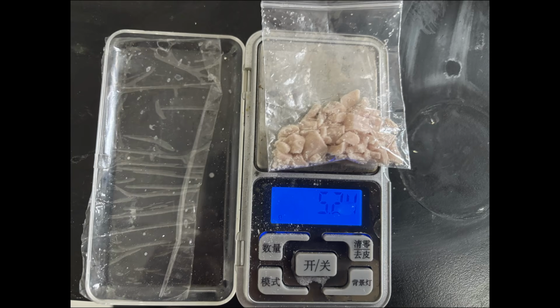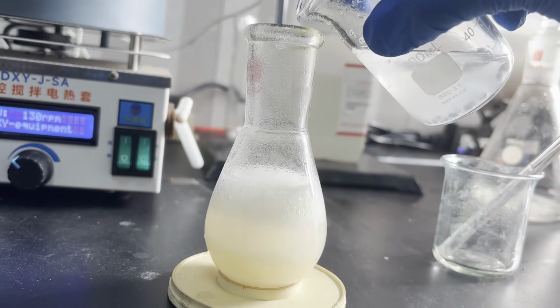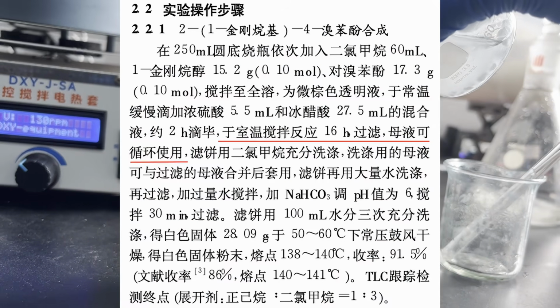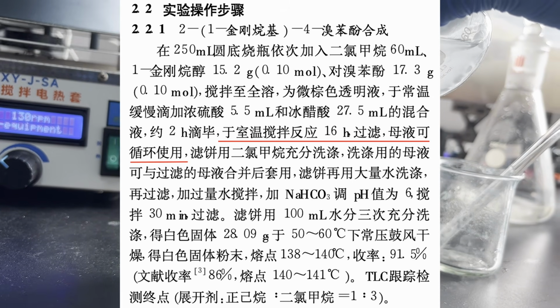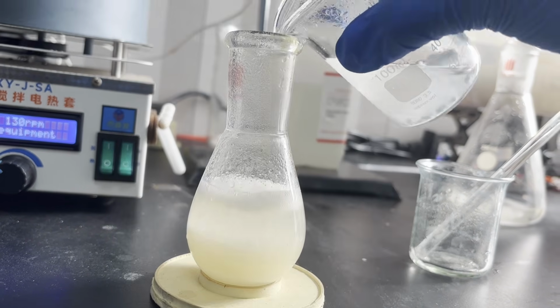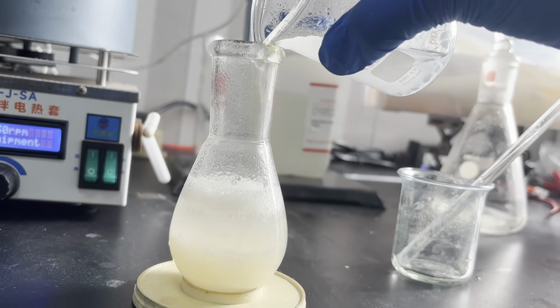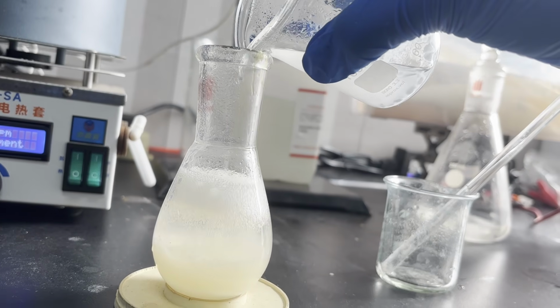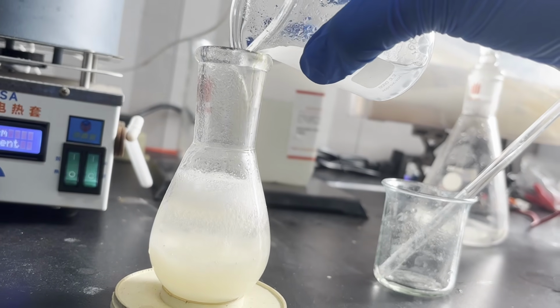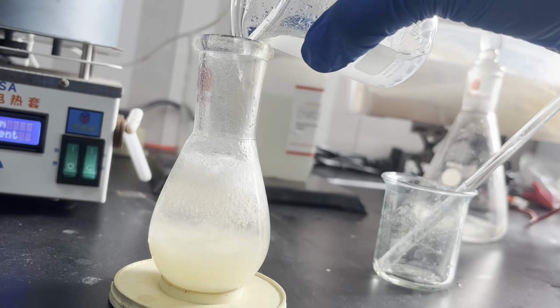Looking back on more recent literature to find out why the reaction didn't work, I found one that mentions that the product is filtered from the reaction mixture, washed with DCM and water, and allowed to dry. So the precipitate in the reaction mixture is actually my product. Well, that shows that my reaction worked perfectly fine, and using this workup procedure, I can even recycle the mixed acids for another run instead of neutralizing them with sodium bicarbonate. This just makes life so much easier.